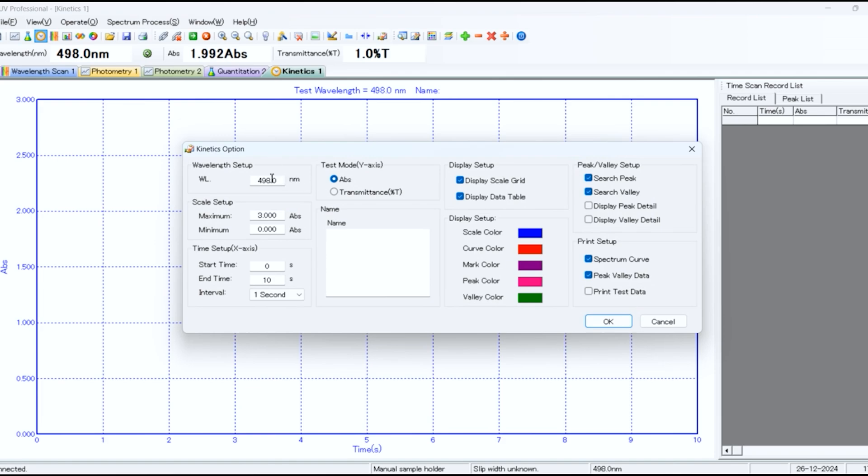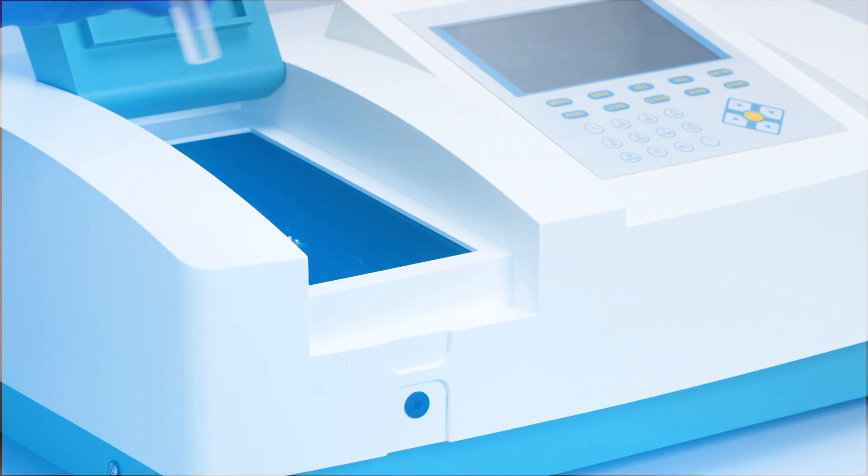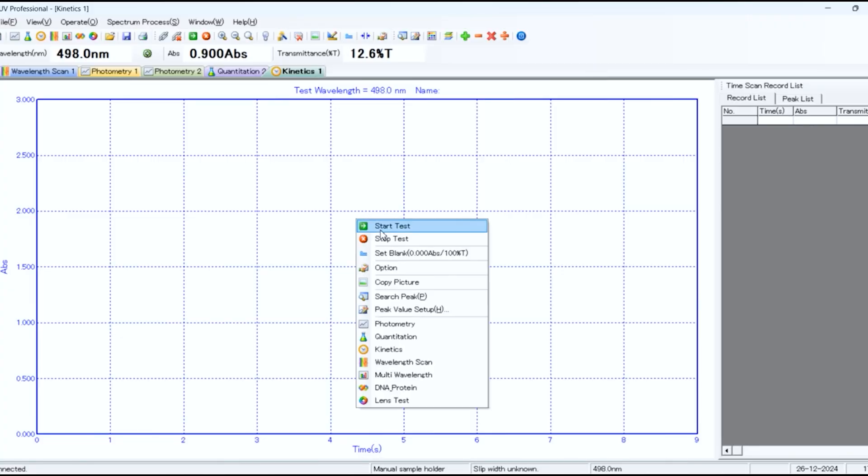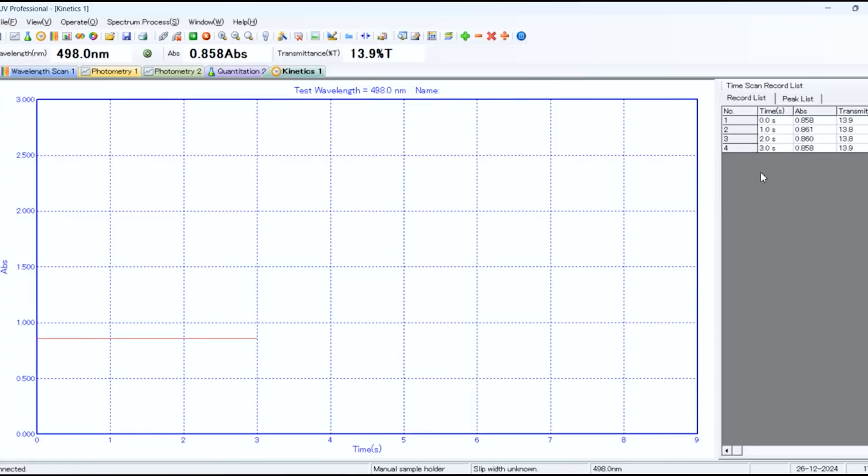Select kinetics and input parameters like wavelength, start time, end time and interval. The kinetics mode will be plotted with readings displayed on the right.